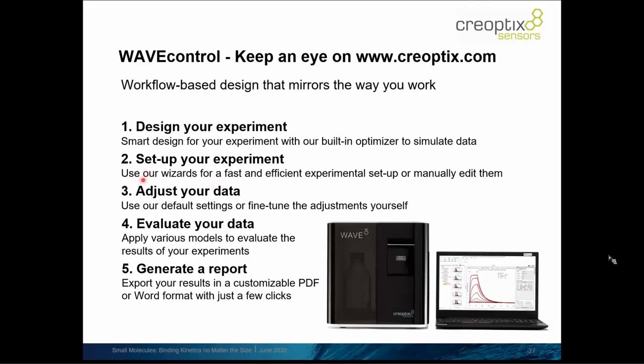Then the software does data adjustment. It does it also in a kind of an automated way, but again, also here it leaves you the full freedom to control and to see the adjustments yourself and change every parameter. Then, of course, evaluate your data, do your kinetic evaluation within the same software, in the same file, and in the end, even generate reports that you can export to PDF, to a Word file with templates, giving a full experimental report on your study.